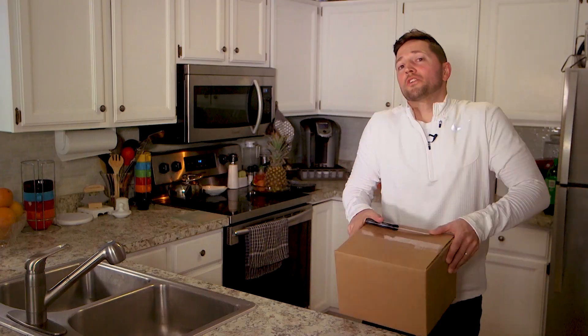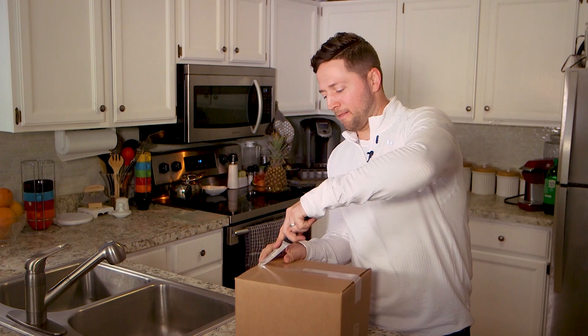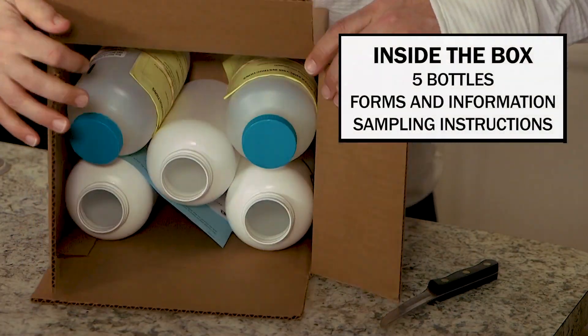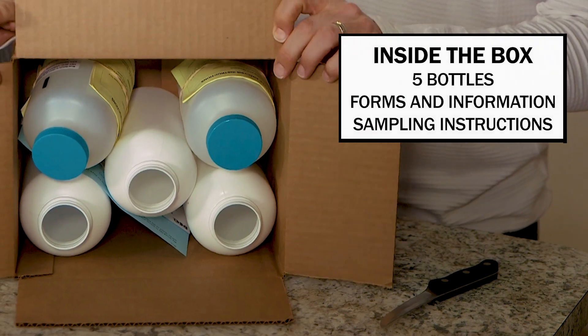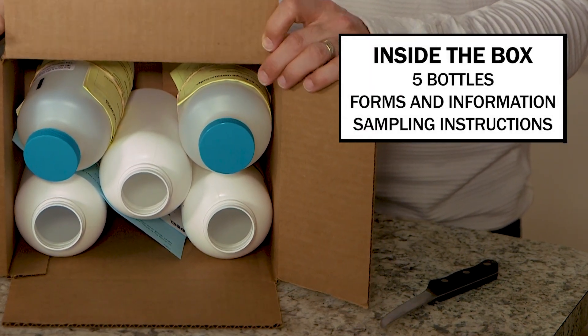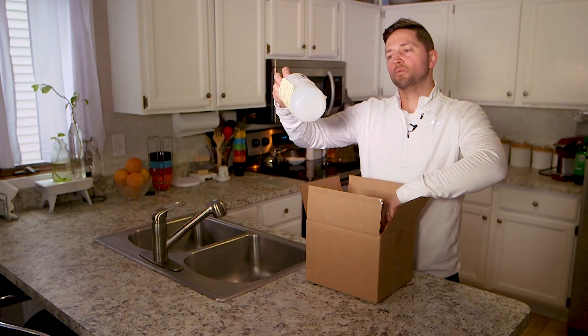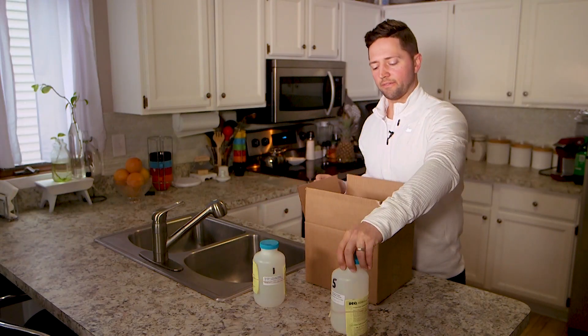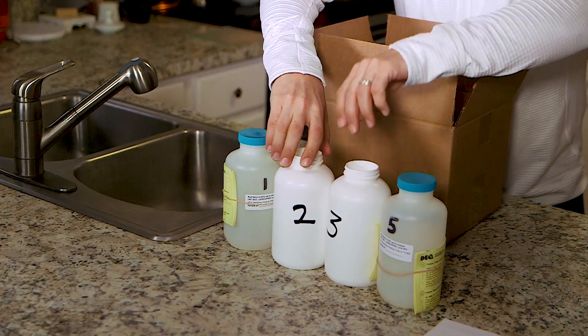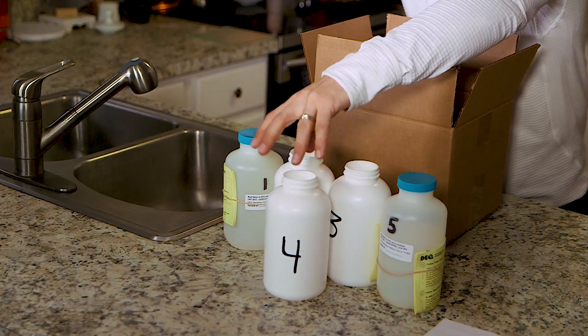Once the waiting period is over, it's time to inventory what's in your box. Inside you will find five bottles and some forms. There should also be a set of written instructions outlining the exact things we are showing in this video. The bottles should be labeled one through five. Bottles two, three, and four will appear different.